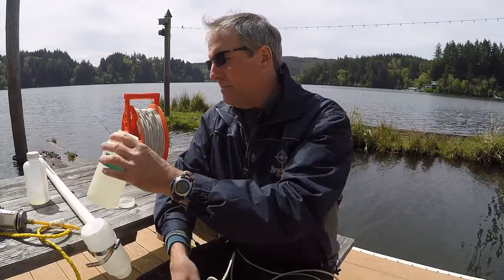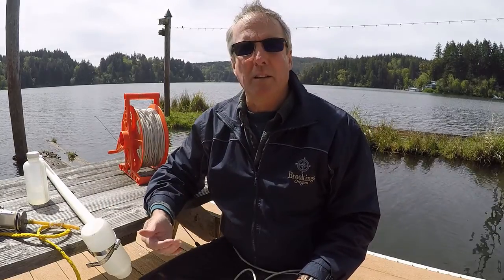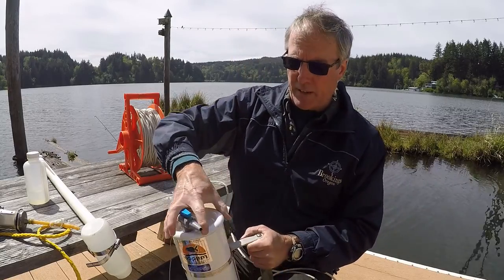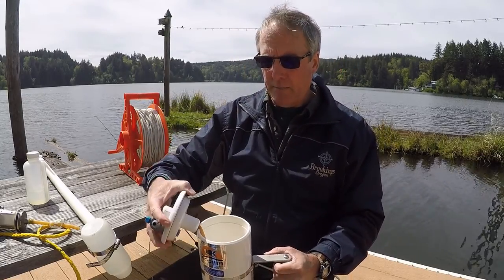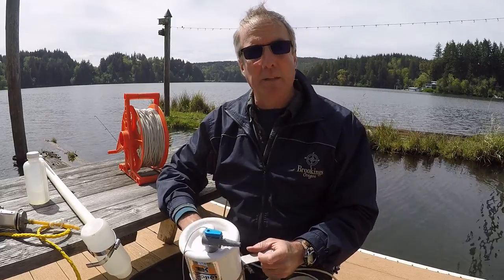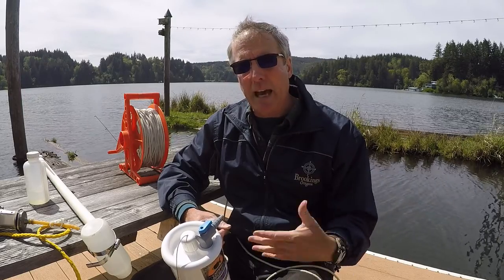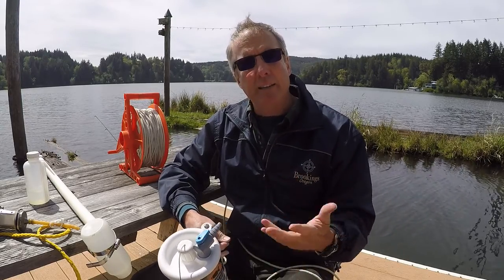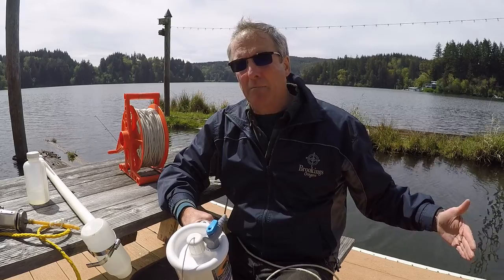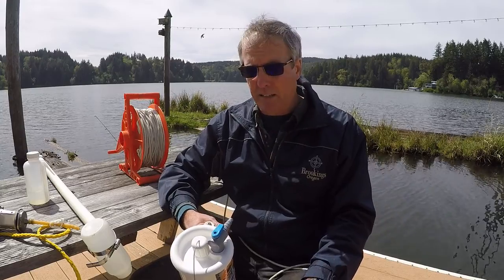If you're not actually taking a water sample, or after you take your water sample, you may want to get some readings on your parameters, which you remember are your dissolved oxygen, temperature, pH, and conductivity. A lot of times you can take your multi-parameter probes, just put them in here, close the lid, and it locks them into place. As usual, you'd wait a few minutes, maybe 5 minutes, for them to acclimate to the water, and then take your readings. So that's one way you can use a multi-parameter probe that's only got a 5-foot cord on it to get readings at the bottom of a 20-foot lake.